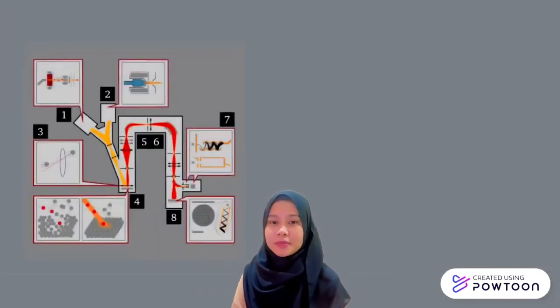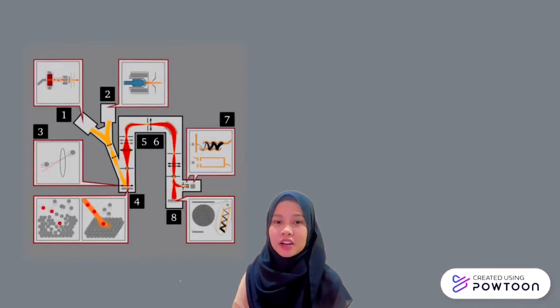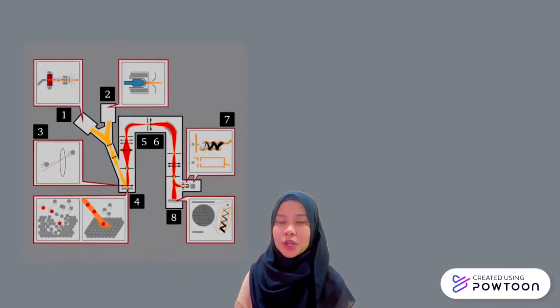Next, I will explain the instrumentation and technique of SIMS. Beside me, there is a very illustrative scheme of a SIMS setup. The numbers given in brackets refer to the respective figures shown.